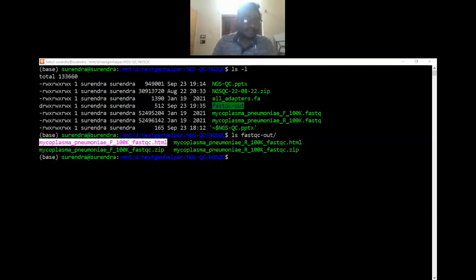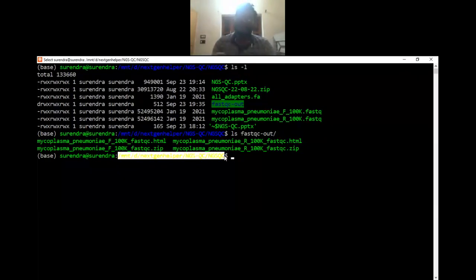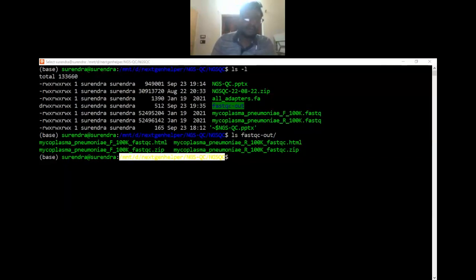So let me open that, and this is present in this particular directory here. You can navigate to this place and then open the HTML file. As I am using WSL here, I will open it from the Windows side, going inside the fastqc directory and then open the forward and reverse HTML files.